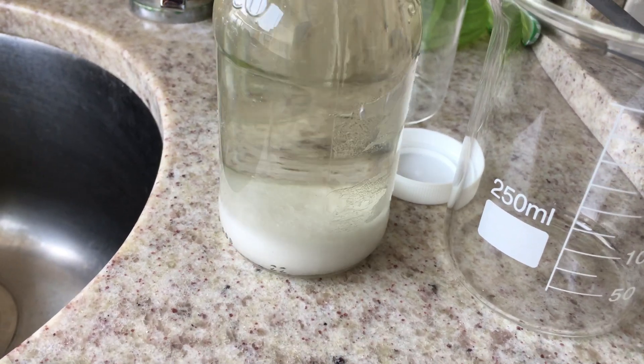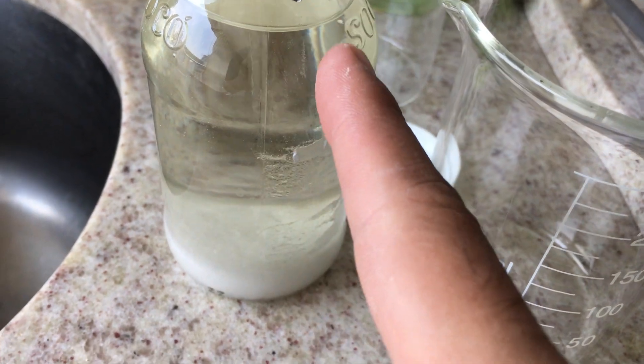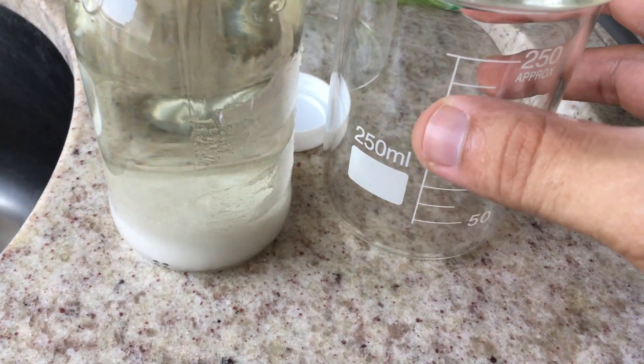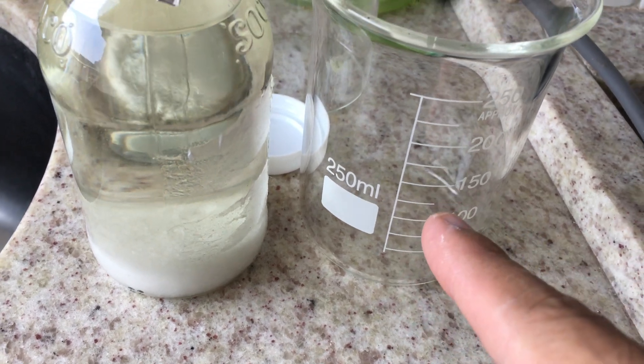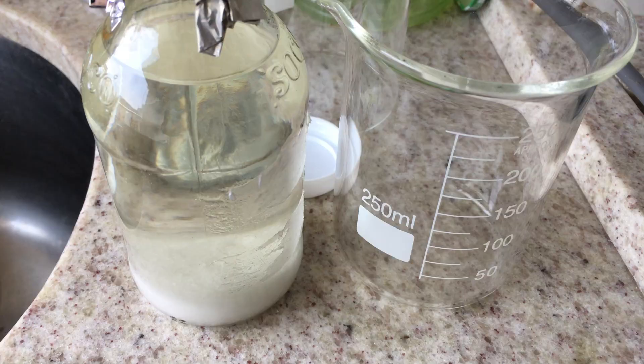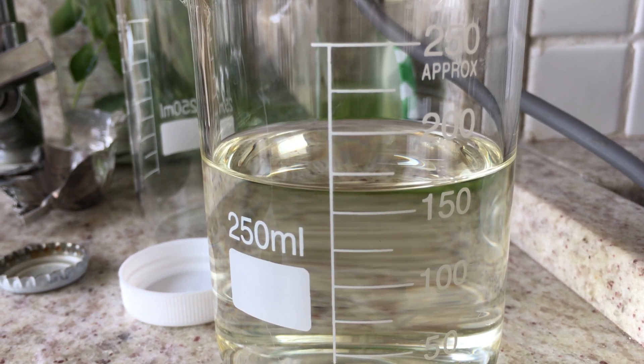Here's the crude ethyl acetate that I separated from the nail polish remover, and I'm going to distill it. I'm going to measure out the starting amount and then show the setup. I have around 175 milliliters.